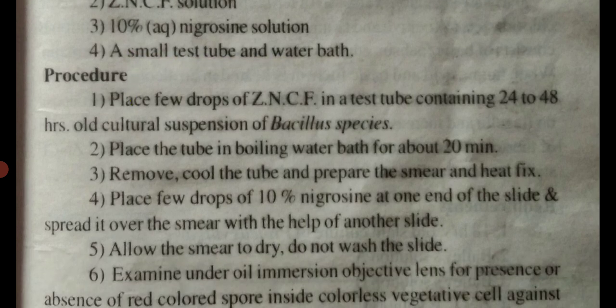Procedure: place a few drops of Ziehl-Neelsen carbol fuchsin in a test tube containing a 24 to 48 hours old culture suspension of a Bacillus species. Then place this tube in a boiling water bath for 20 minutes.